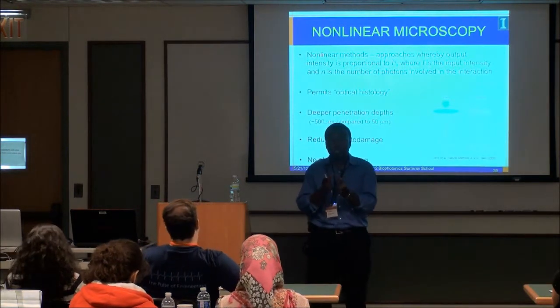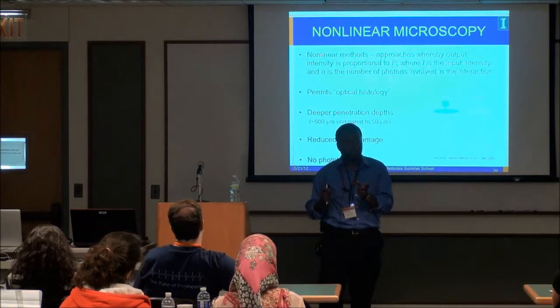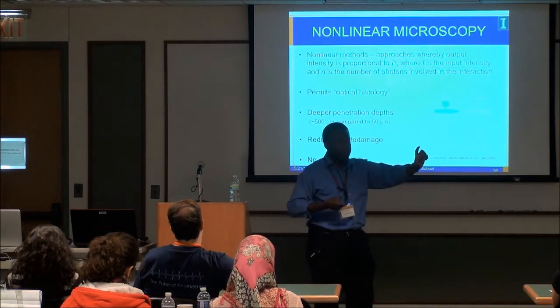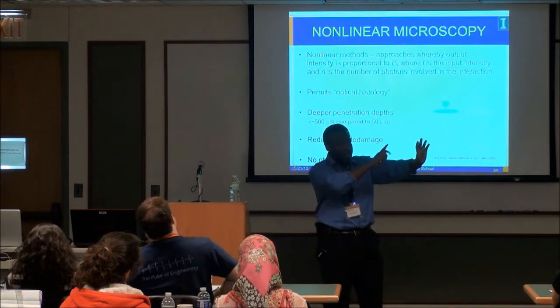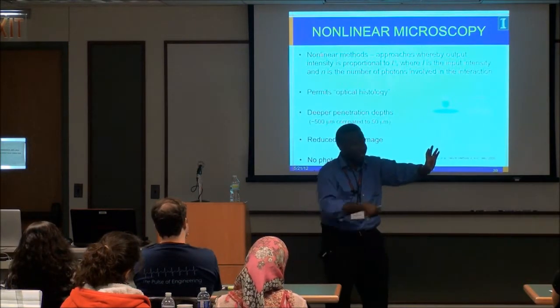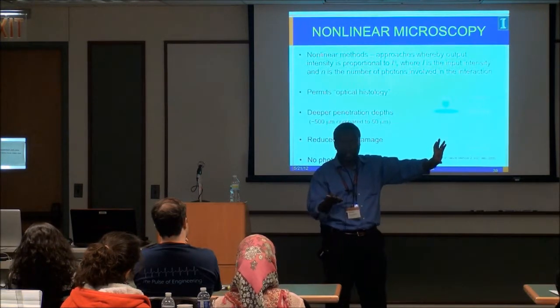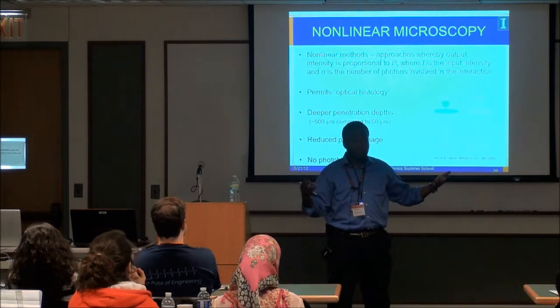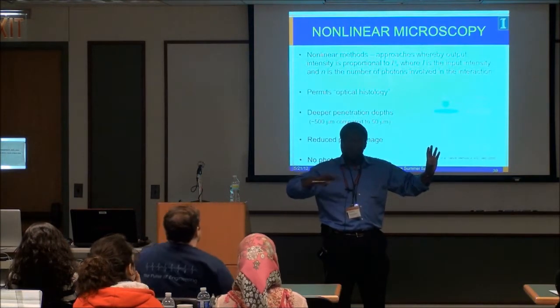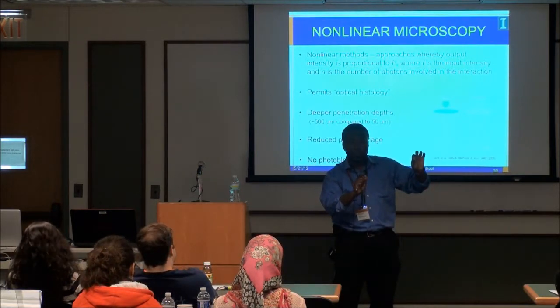With these people who do tissue scattering work, one thing that was recognized recently is that if you shape the input wavefront, light that would normally appear to be opaque can be controlled. Imagine taking a piece of glass, and we've done this experiment in my lab, it's the coolest thing. Take some nail polish, maybe it contains zinc oxide, I don't know, paint that glass and shine a laser beam on it. There's a lot of speckle. Professor Popescu talked about speckle, it has to do with the coherence of the light. That process can be described by diffusion, but diffusion does not contain information about phase.